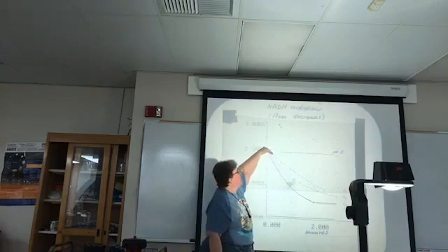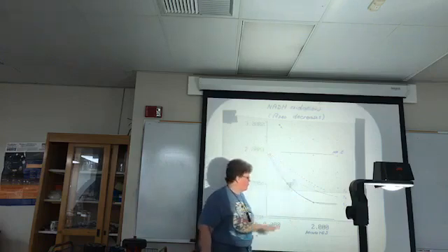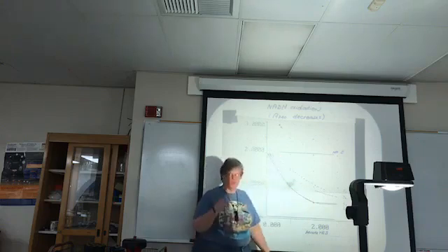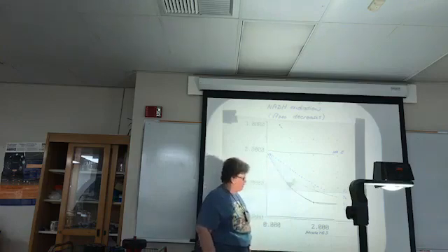So you're saying, okay, I'm starting up here and I'm measuring the change in absorbance with change of time on this axis right here, and this is absorbance right here. And so this is your dA/dt, which, using the extinction coefficient, is turned into the velocity of the reaction.